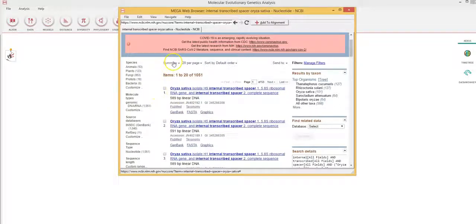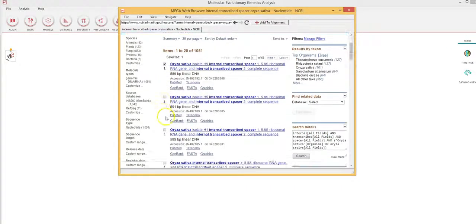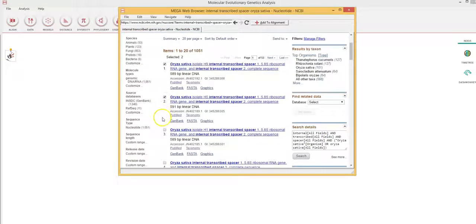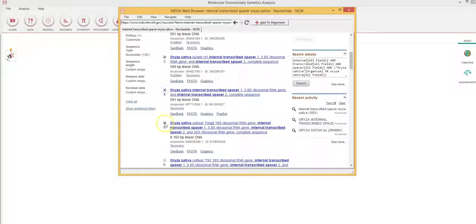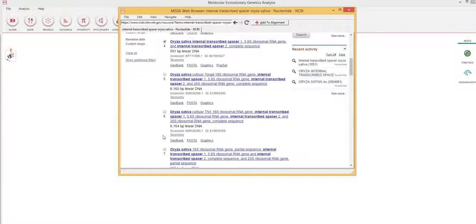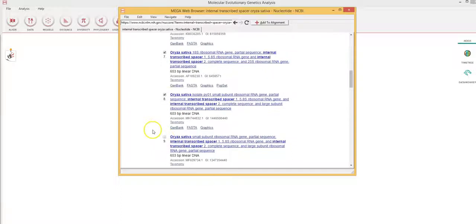In order to identify the sequences, I have to look at the FASTA sequence. The FASTA sequence is recognized by this particular software. So I'm going to reject sequences that are too large and need to be trimmed. I'll select sequences within the range of 500 to 800 bases.